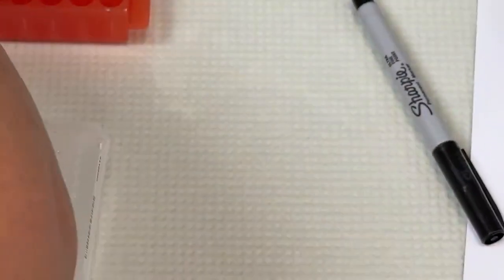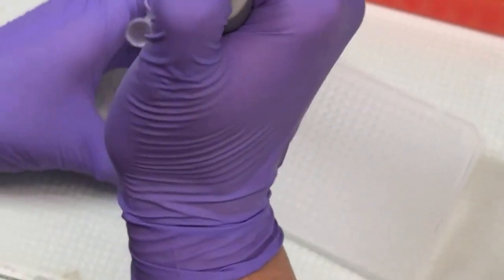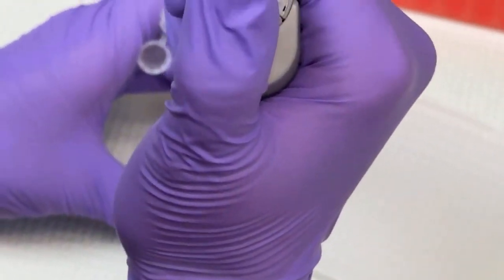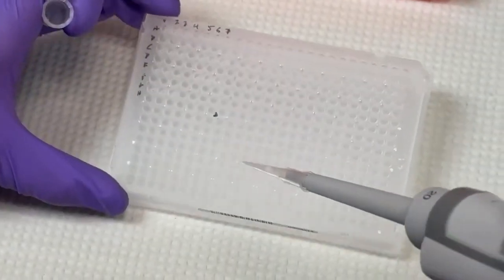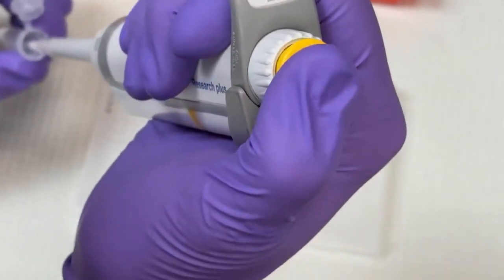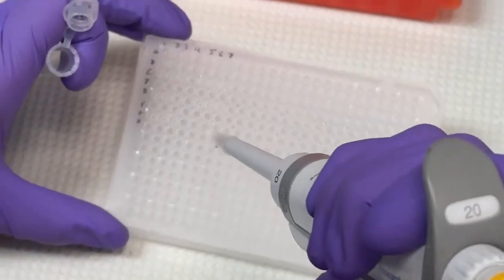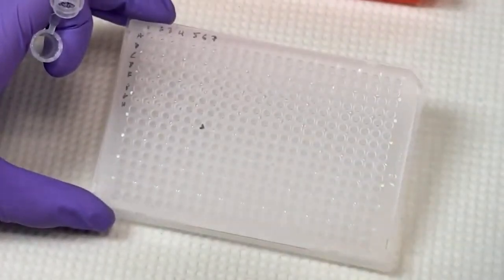Oh, I found a mistake. Why didn't anybody tell me? I put it into F instead of E, so I'm going to recover that and move it to the right place. Excellent. All better. And now, sometimes you can tilt the plate like this and get a reflection off of the solution surface if you're having trouble seeing what's going on.